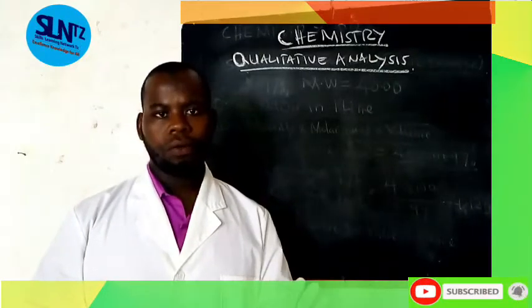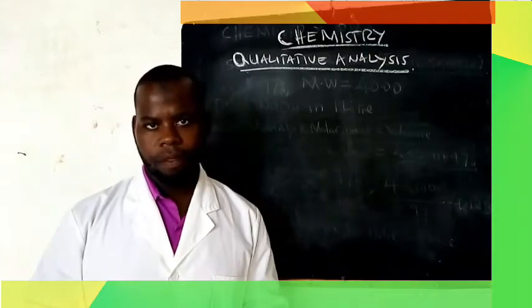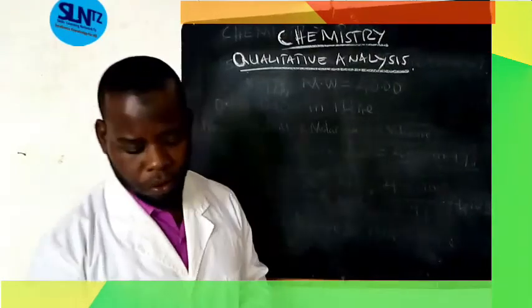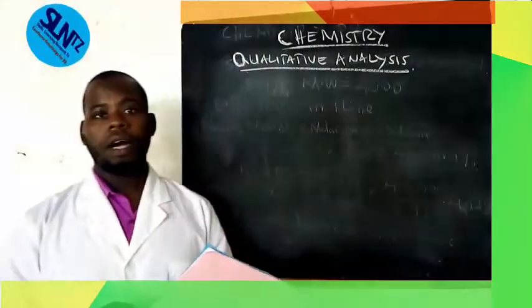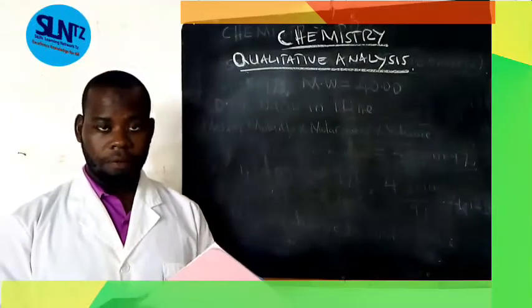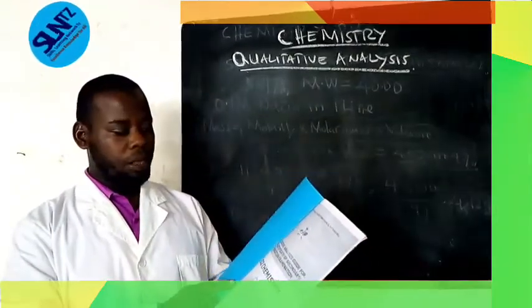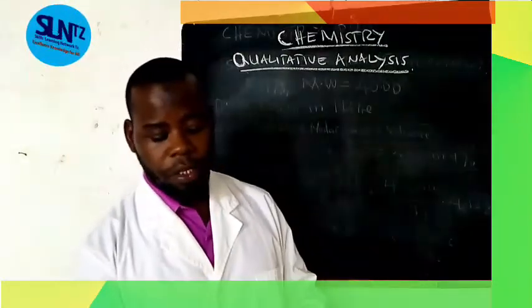And I will teach you the first step, preliminary test. We have different steps in preliminary test. When you open your sheet, let's say this is the sheet for O level, for a Form 4 student, but you have another qualitative guide sheet for Form 6.